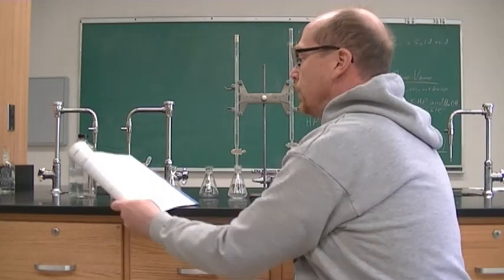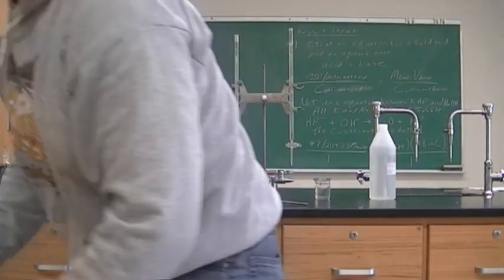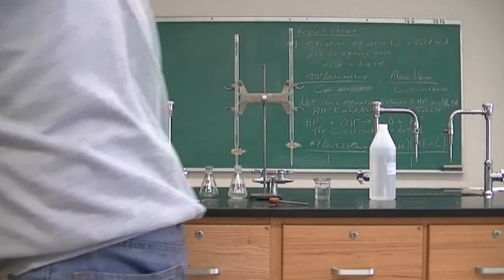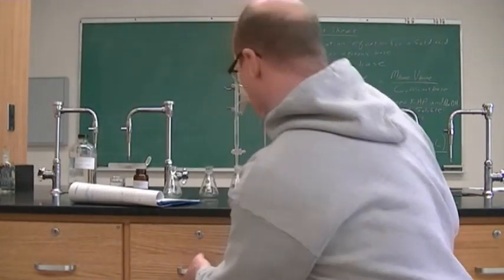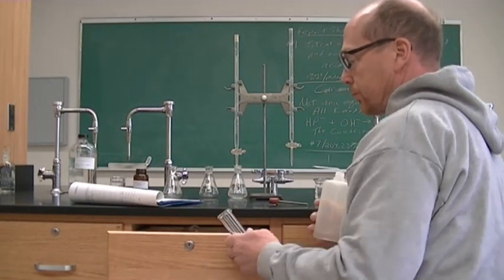Alright, and so now it says to add about 15 mils of deionized water, which I have right here. So we're going to add 15 mils of deionized water.